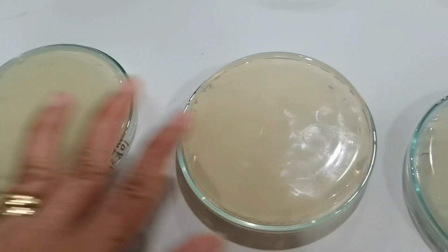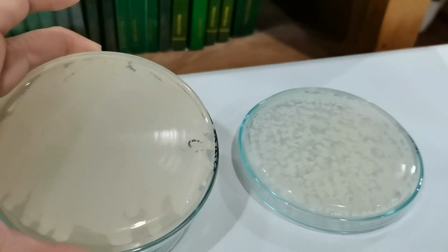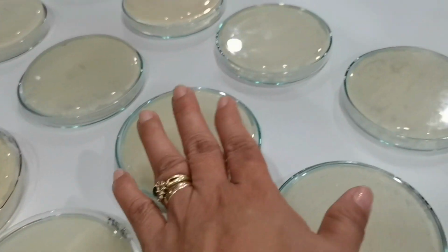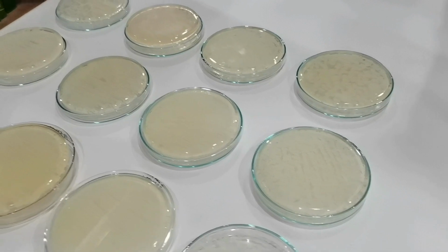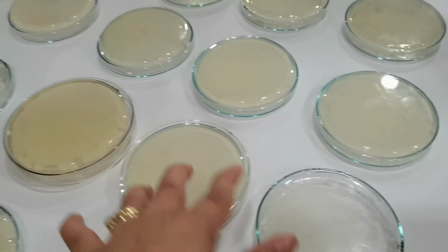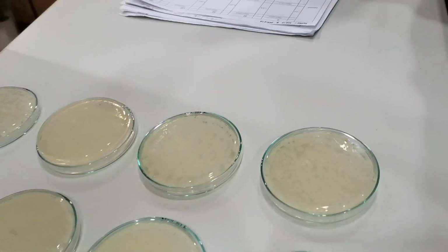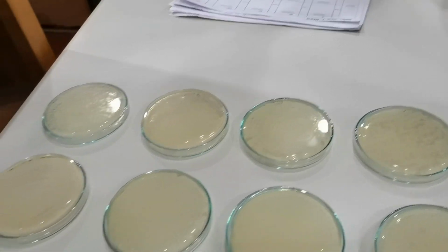So if we put that next to this, you see the difference? Yes. So we will modify the experiment, and we will try higher doses or higher exposure times. So we didn't see much of a difference between the plates exposed to visible light after UV mutagenesis and those unexposed, so there's no difference really. So we will try again because it was a cloudy day anyway.